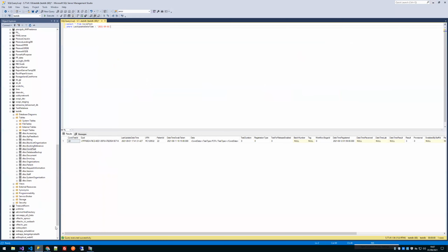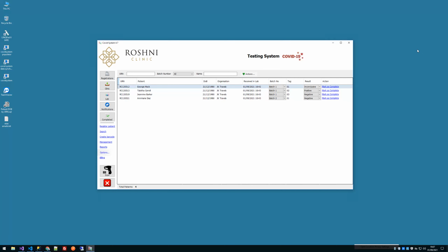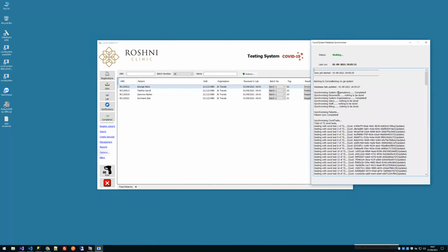I mean, you're from a tech background, aren't you? Not really. Oh, okay. I was going to show you some tables where all this is audited. But ultimately, it's all the BioRad machine. Okay, the BioRad. That's cool. I think this is the first I've heard of that one. To be honest, I've not heard of that one.